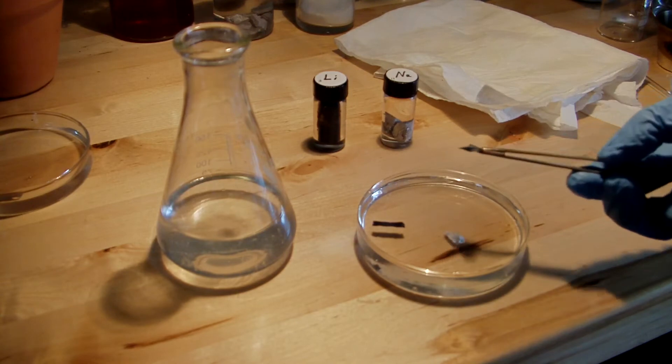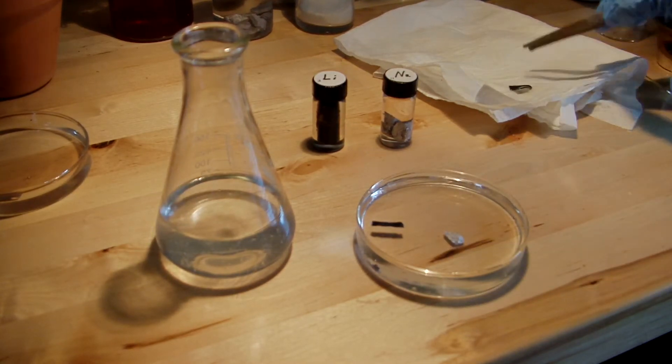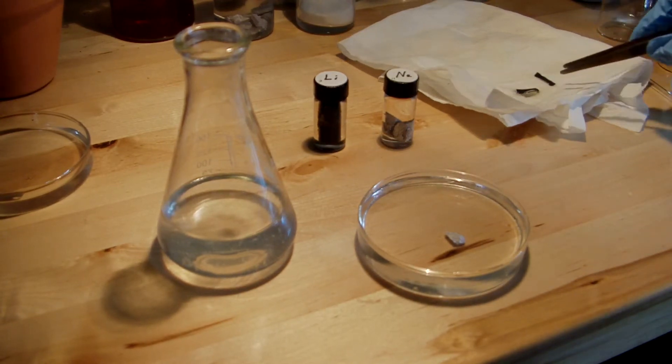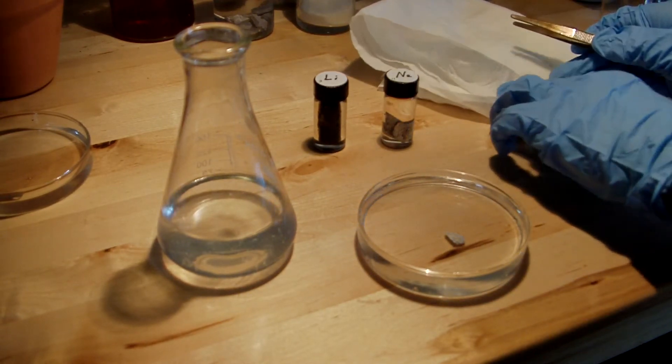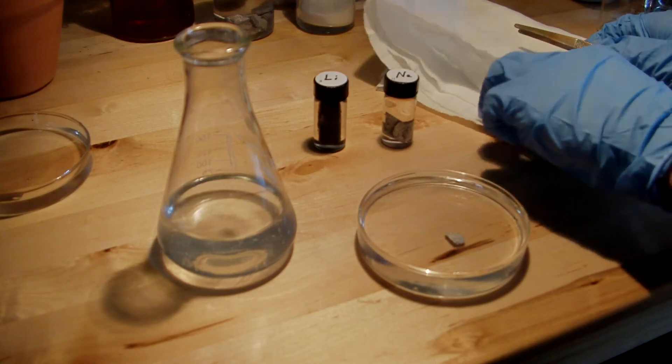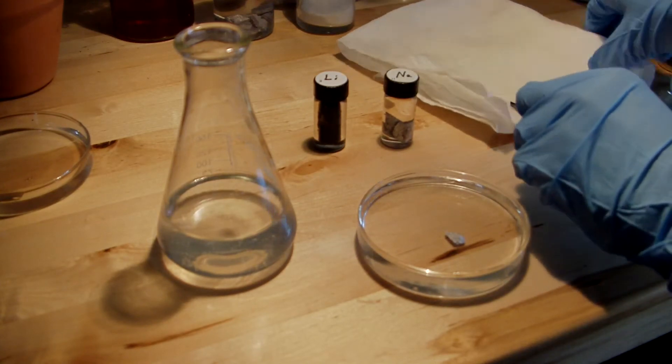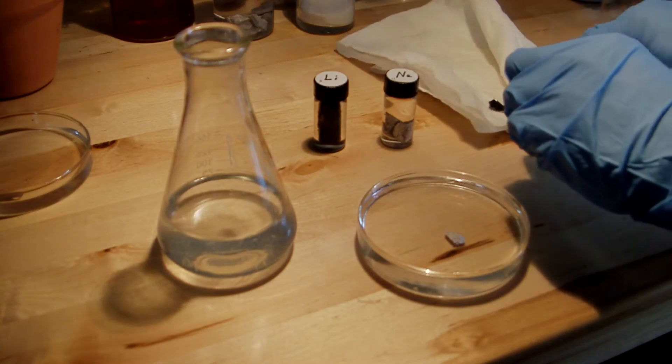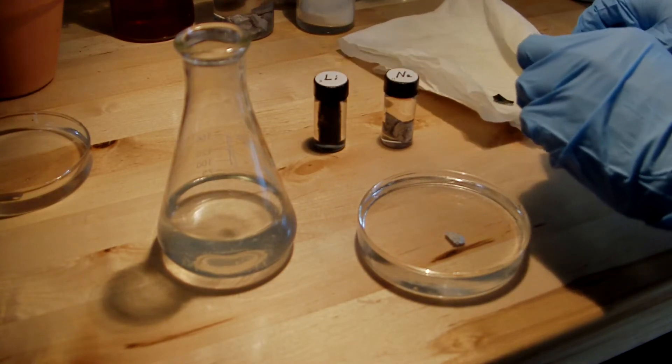So you can see the lithium is in a form that's just a very thin foil. And it looks darker but that's only because it's more tarnished. Both of these metals, if left in air, will very rapidly tarnish and form hydroxides on their surface.